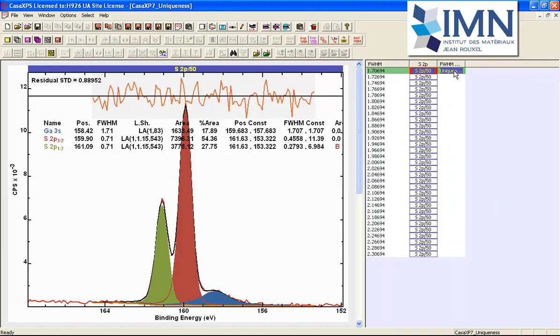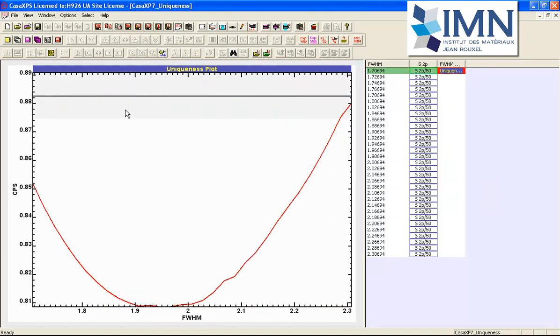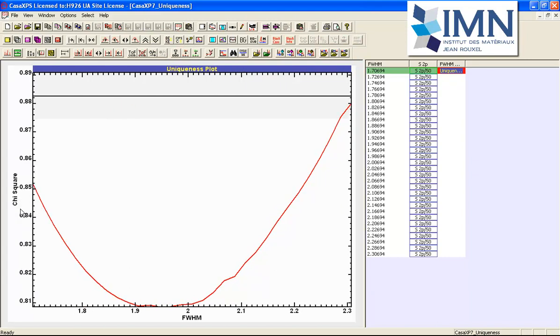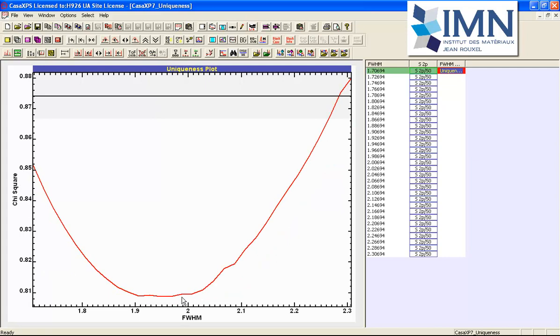When completed, we have a plot showing a curve. Changing to the alternative axis — chi-square instead of intensity — this indicates the chi-square obtained for each fixed value of the full width half maximum. When fixed at a value between 1.9 and 2, the curve is quite flat, so there is very little change in the residual standard deviation across this interval. Outside this range, the residual begins to deteriorate. It should be noted that every point within this interval would represent an acceptable chi-square for fitting of the data.